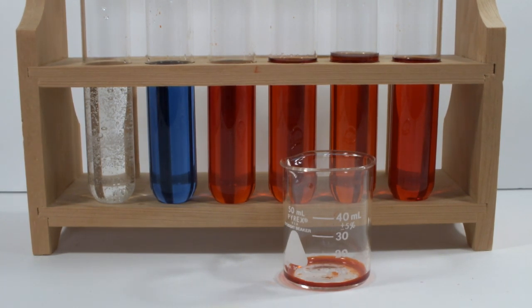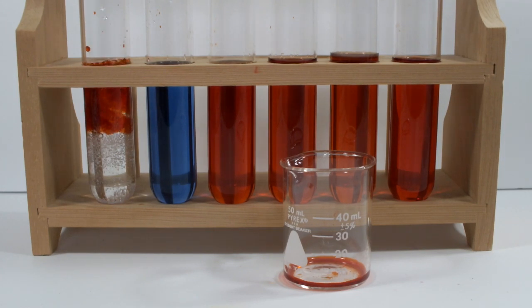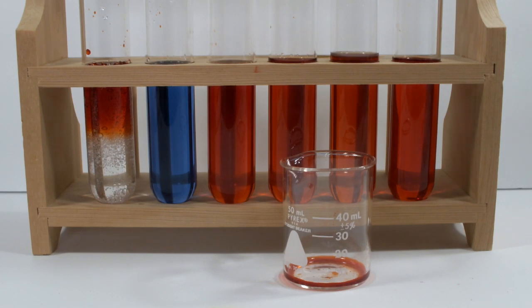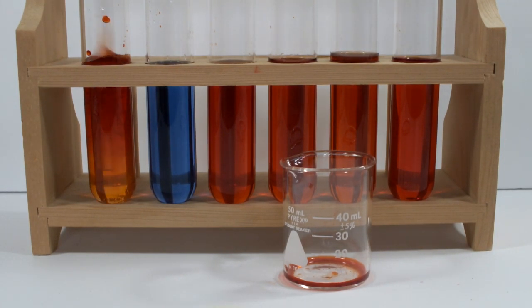Well, as you can see from the beaker, that brings us to the end of the ferroin solution. This last tube is 35% hydrogen peroxide, which I'm assuming is going to have the same reaction as the nitric acid did.